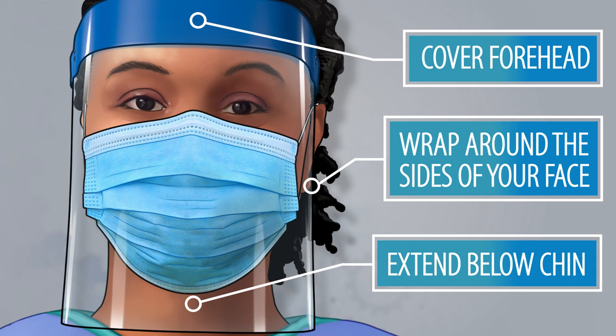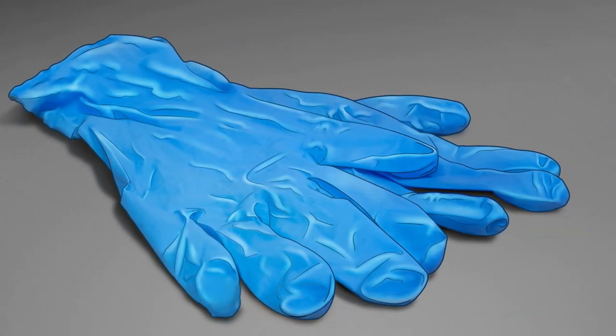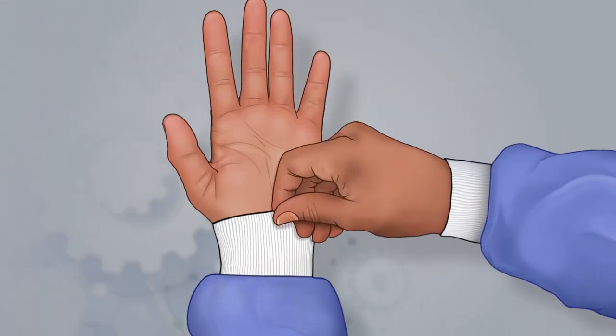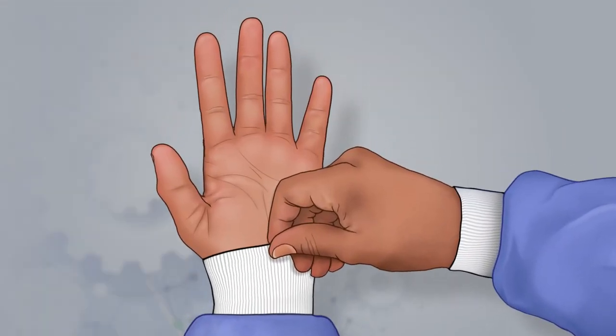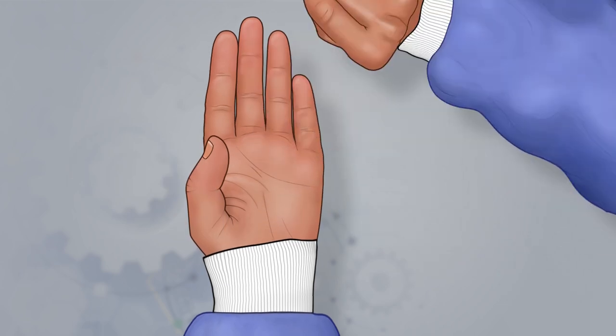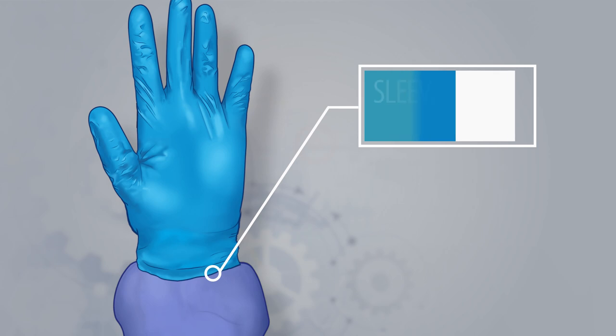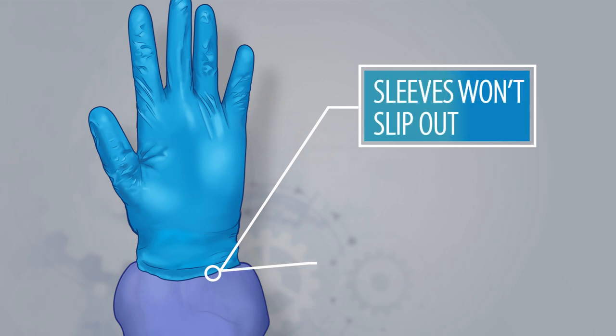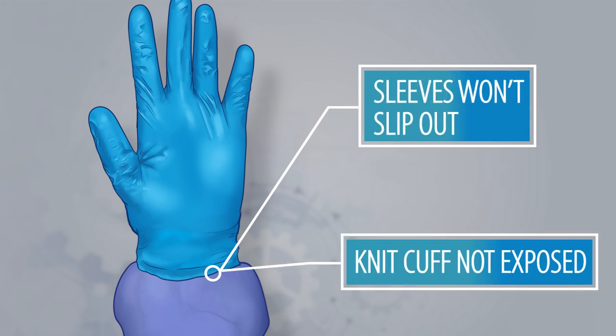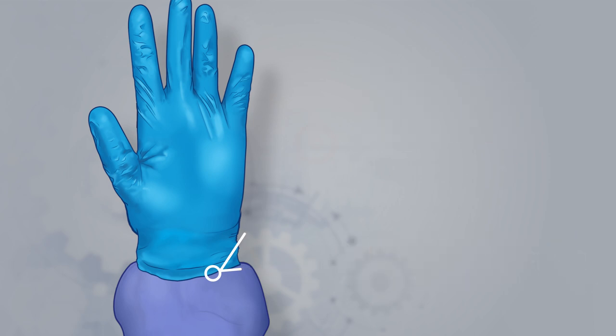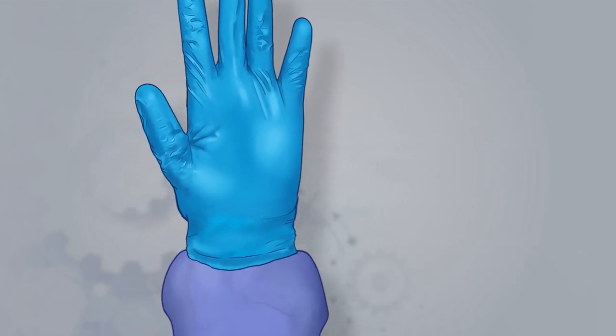And finally, put on your gloves. First, pull the gown's knit cuff down around the palm of your hand and then pull the glove over, not under the cuff. This helps ensure your sleeves won't slip out and the knit cuff won't be exposed to hazardous materials during work. Ensure there are no punctures or tears in the gloves before beginning work.